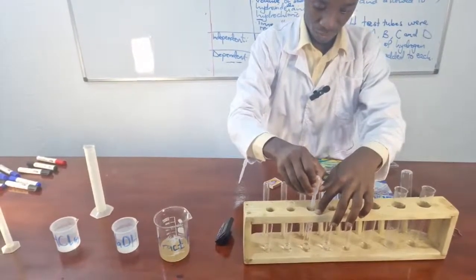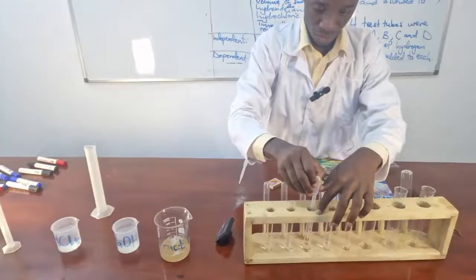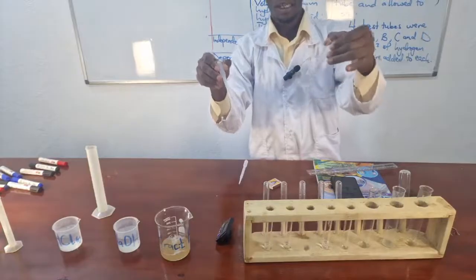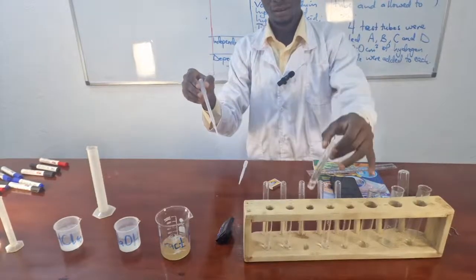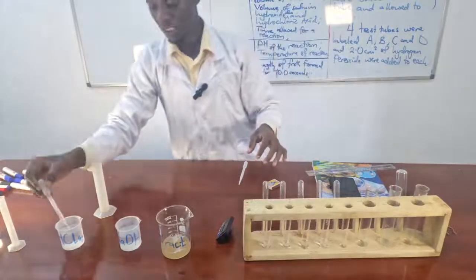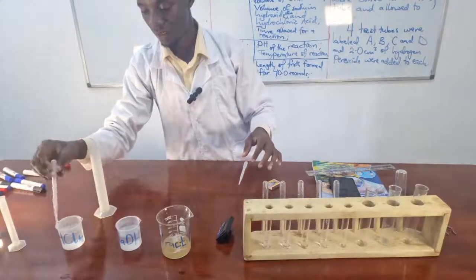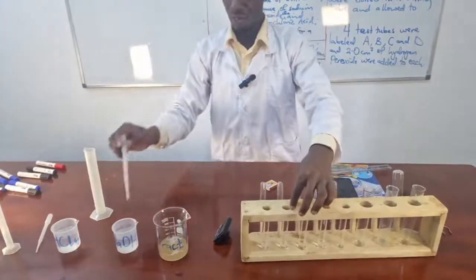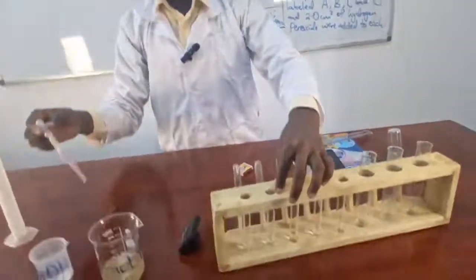That is 1, 2, 3, 4. Shake to ensure mixing. So that is hydrochloric acid. And in B, I'm going to add 4 drops.